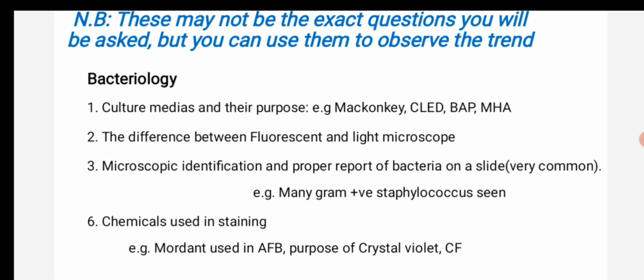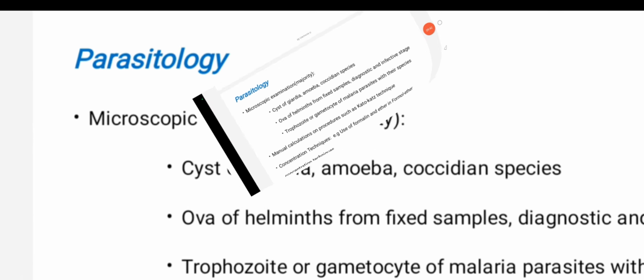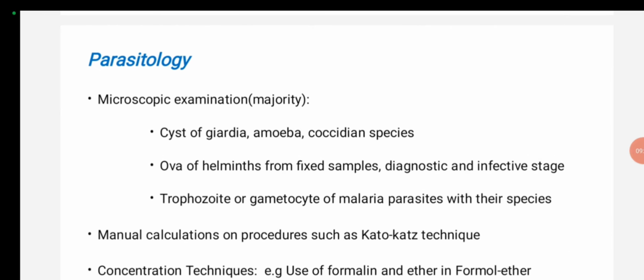Antimicrobial susceptibility tests we may be asked to measure, and also the staining behavior and the report format are very important in microbiology. So don't forget to review this. These are important and the most common in bacteriology. Okay, let us go to the next section.